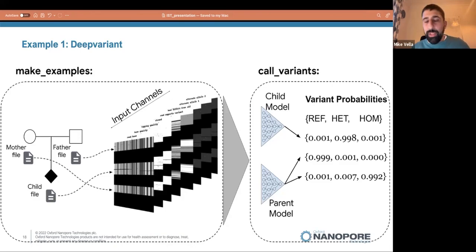These tools called variant callers have existed for a long time, and what they do is take DNA sequence at a particular point in, say, a human genome, and at what we call a coverage, that's an average depth that a particular region of DNA is covered by. Using models of expected DNA sequencing error and so on, they try to infer how this particular genome is different from a reference genome. As I mentioned, these tools are rather sophisticated, and they are, just like any other scientific software, prone to making errors.